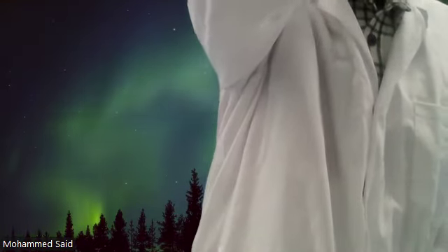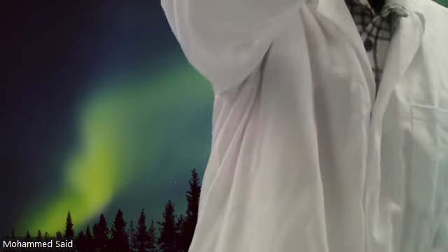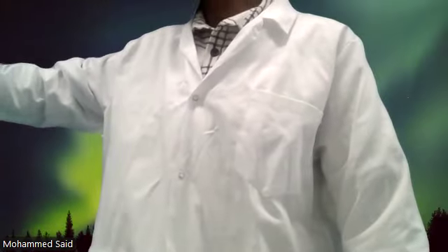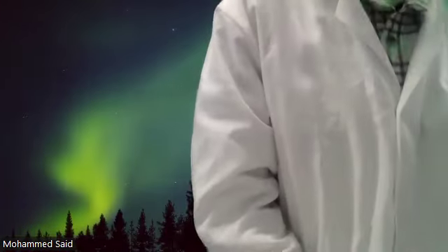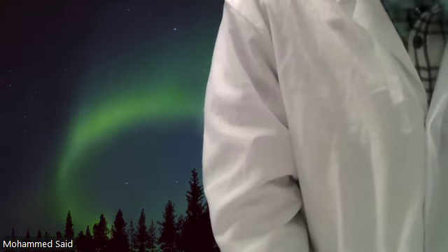So let's start asking questions. Amro, what's your group looking like? Where are you guys at right now? Number 2, gram stain. Okay. What are you guys on right now? Gram stain or capsule stain? Gram stain. Okay, and a mix of two? Okay, so I'll wait then before moving further.